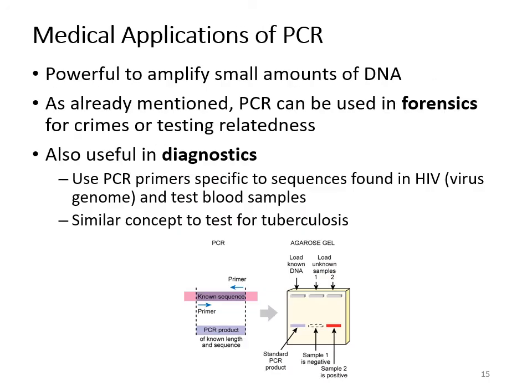There are also a lot of medical applications of PCR, whether you're doing regular PCR or the big time qPCRs, okay? And with these bullet points that I have on this slide, keep in mind that there's a whole lot more you can do with PCR. This is just the sampling.